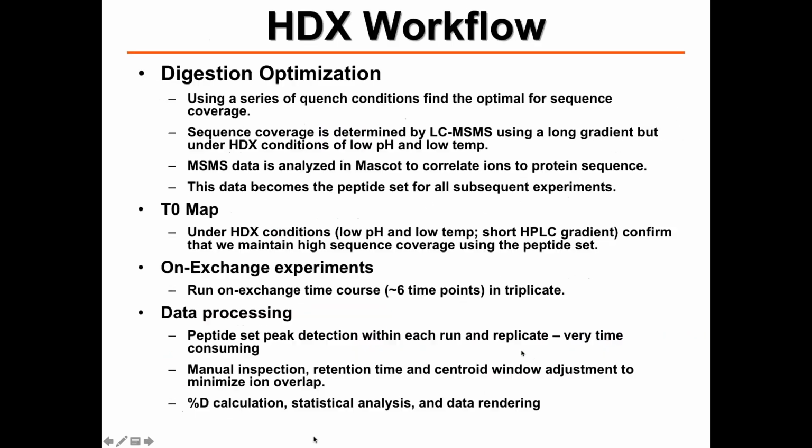So, yes? Maybe I missed this, but what governs your efficiency? Proteins that, or your coverage. Yeah. Right. So a couple things. One is, can we find a quench condition that, under this relatively short exposure to the pepsin column or the protease column, is sufficiently denatured that we get lots of digestion of the target protein? In other words, we have to generate those proteolytic fragments to get the sequence coverage. So if we get poor fragmentation, we have poor sequence coverage.